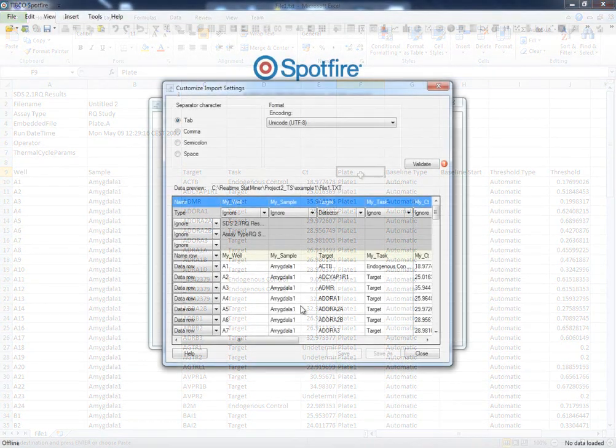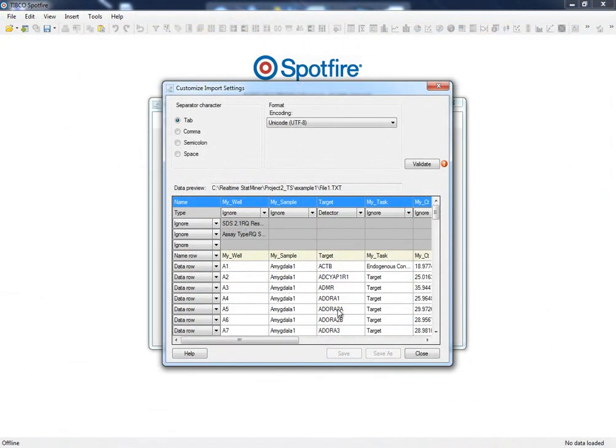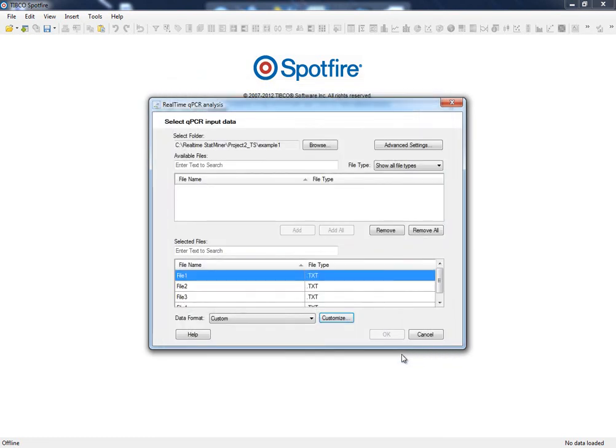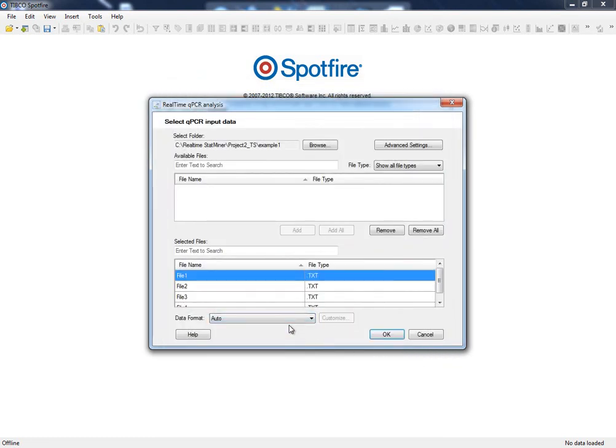As mentioned before, StatMiner automatically recognizes a wide range of platforms. It means that it is able to open data files and retrieve samples, targets information, etc., as long as we keep the auto mode selected.